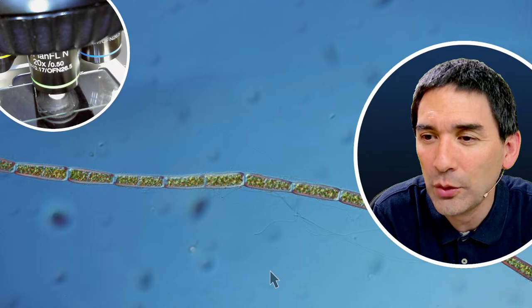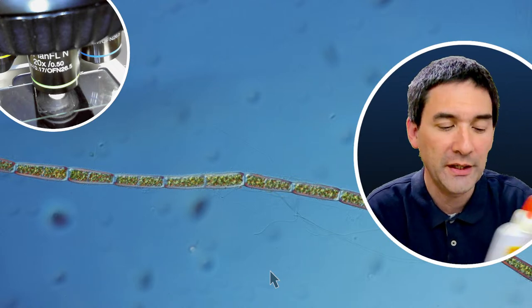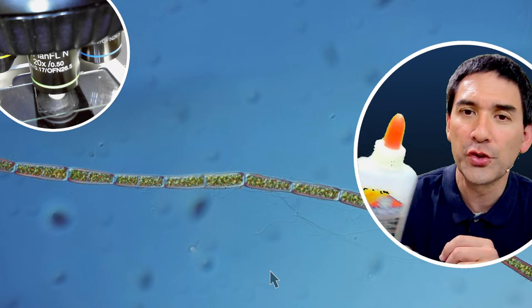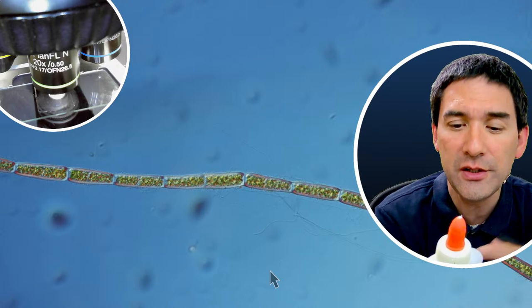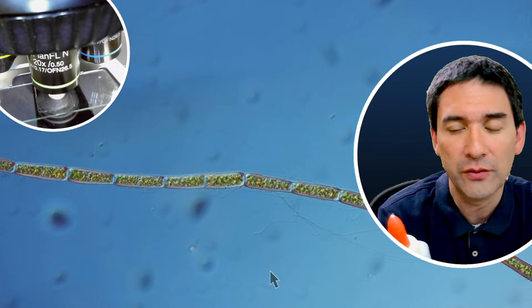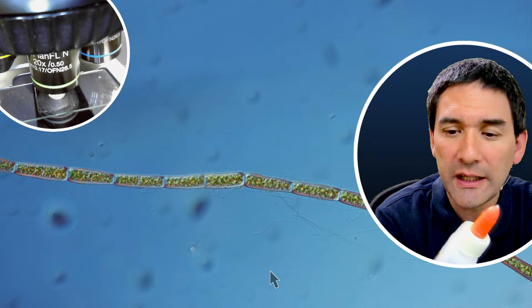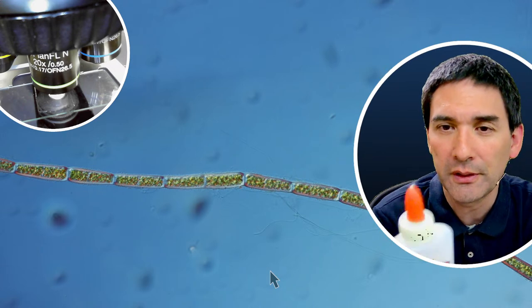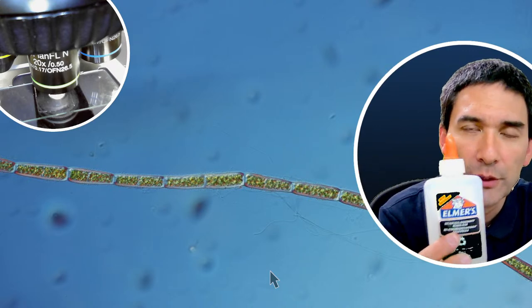I heard that it's diluted with 10 to 15% water. Yes, this is what I have done. Without actually measuring it, you can of course use the glue directly. I have also done that, but I found it easier to use if I add around 10% water. It makes it a little bit more liquid, and then it flows better. But it's possible to use it also directly. I would say it's more a question of personal preference.